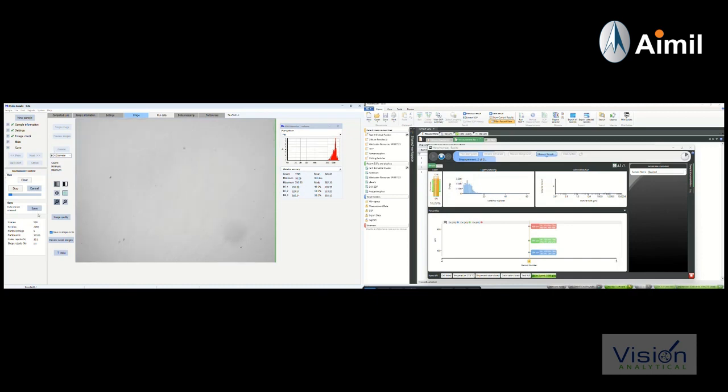So as you can see here, we're already running 37,000 particles per ml, a total of 3,000 so far. And again, we're looking at a volume weighted distribution, comparing it to laser diffraction. But when you look at the Hydro Insight, we go to number weighted, we definitely see there's a large population of small particles. These are all these small particles that you see here. So let's take a pause and we'll come back to this.